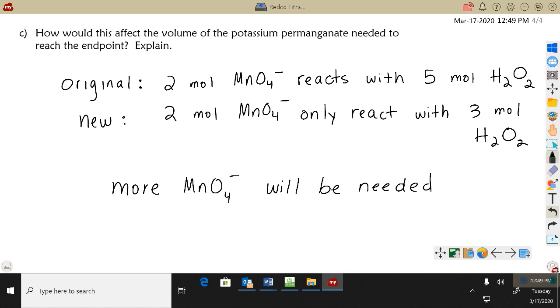But we do have to at least be aware of the fact that you can titrate beyond just the world of acids and bases. It is really just a lab procedure that requires us mixing things together and somehow being able to indicate when we've hit the ratio from the balanced equation. And with a redox titration, if you have a transition metal ion, they often change color in solution. And then that's kind of like a natural indicator.